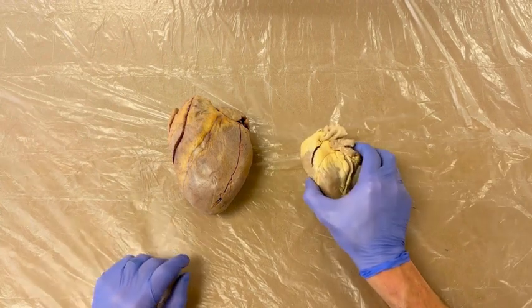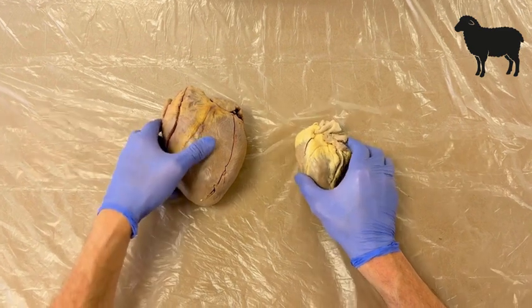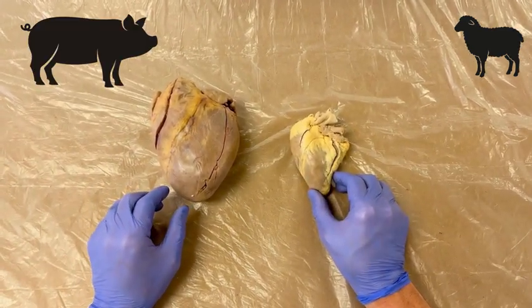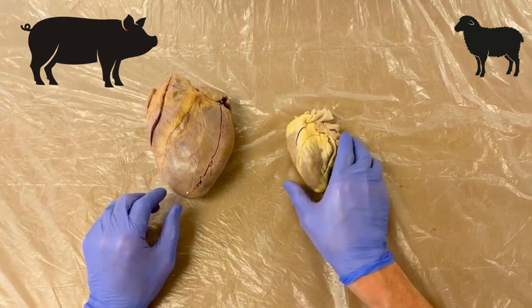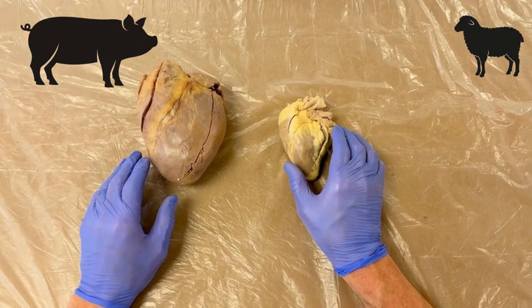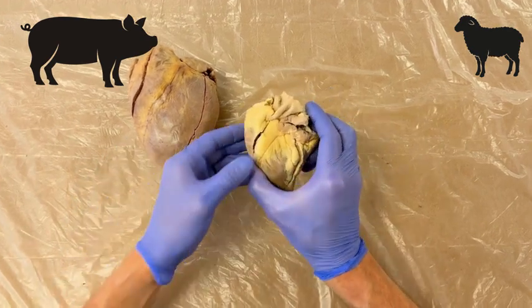Now let's look at the sheep heart. As you can see, it's smaller but almost structurally identical. Sheep are a much smaller mammal, so their hearts don't need as much pumping power, but the organization, the chambers, the valves, and the vessels are the exact same pattern. And so let's walk through the sheep heart.